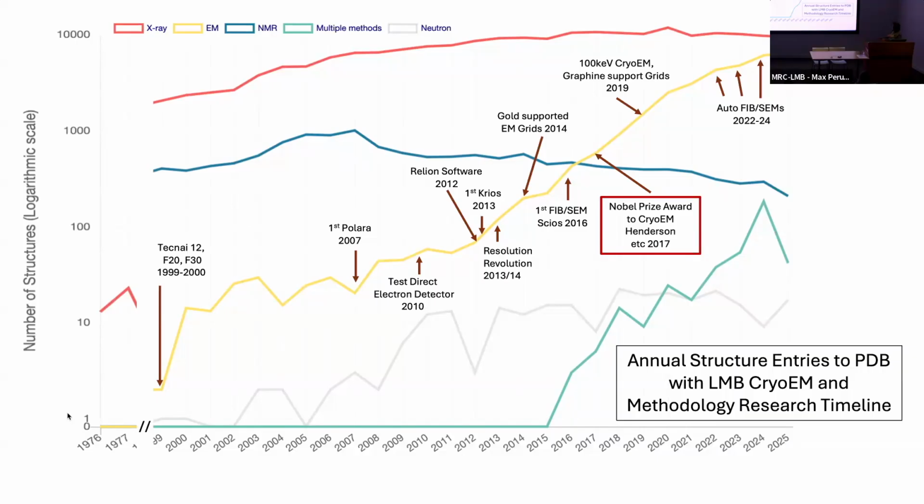So the speed of data accumulation improved many fold. We don't need to stay there one day overnight. You take one box of 56 films, take 2 hours to develop, next day scanning, and a few months, at least half a year, until you start to see what the structure is. Now, we can do overnight data collection, no need to go to the dark room, and then go directly to the computer.